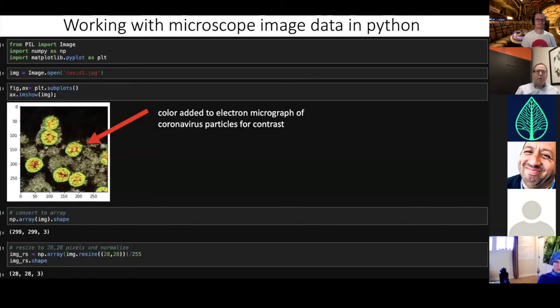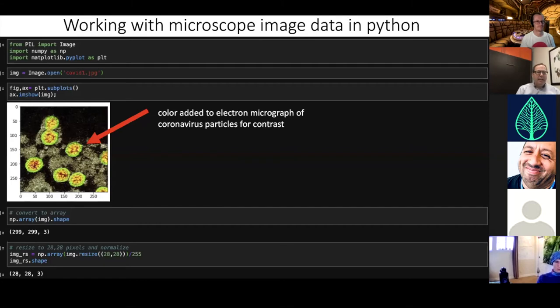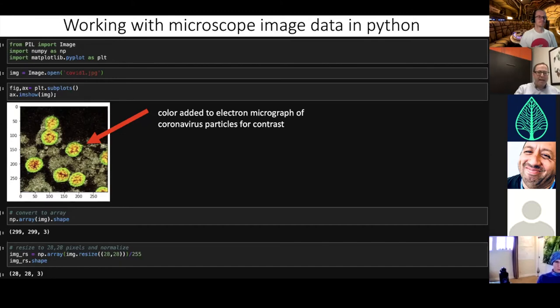When working with microscope image data in Python, there are a lot of different libraries you can use. Here I'm working with the Python Image Library, PIL, and just plotting an image — again an image from the electron microscope of coronavirus particles. They've been recolored for contrast; from an electron microscope you actually get grayscale images.